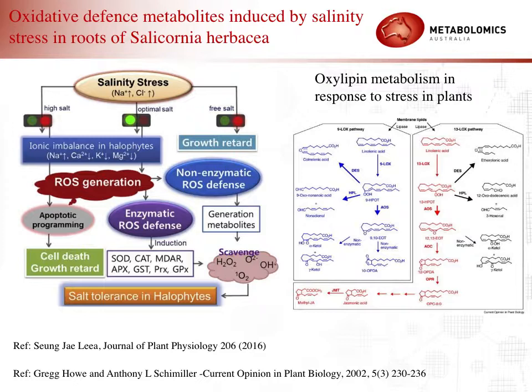The question is, do oxidized lipids and oxylipins in barley roots show any significant changes in response to salt stress? To investigate that, we have employed an LCMS platform to investigate the oxidized lipid profile and oxylipin profile due to salt stress in Clipper roots. The reason we have chosen Clipper for this study is that it shows higher salt tolerance capacity, and we can get more information on the defense mechanism against salinity.